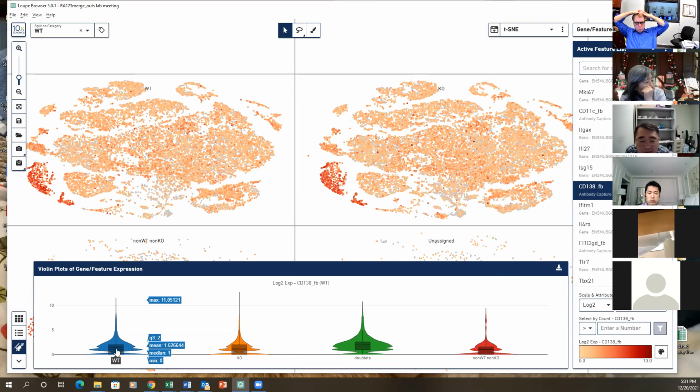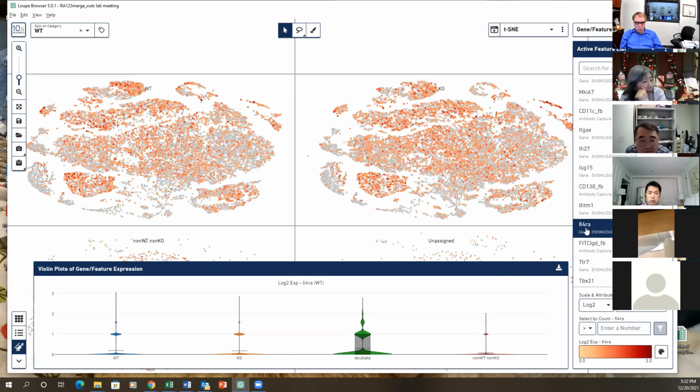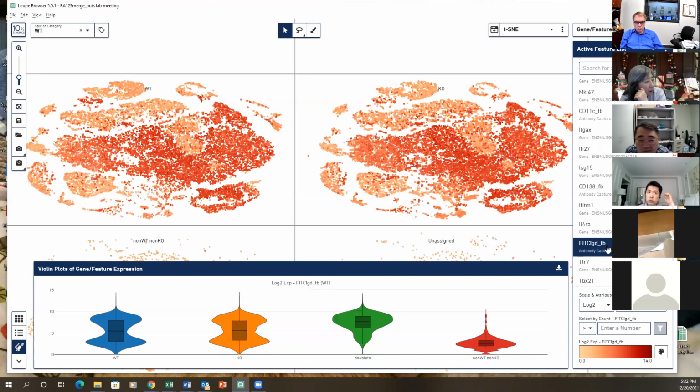As if the control has more, but it's 1.5, 1.3. It's IL-4 receptor. That's kind of low, but similar. This IgD. 17 receptor does have more IgD. This is 5.5, this is, well, okay, about the same.